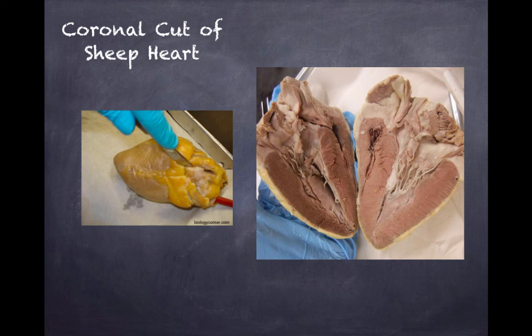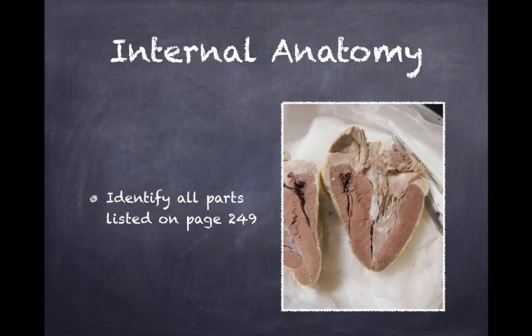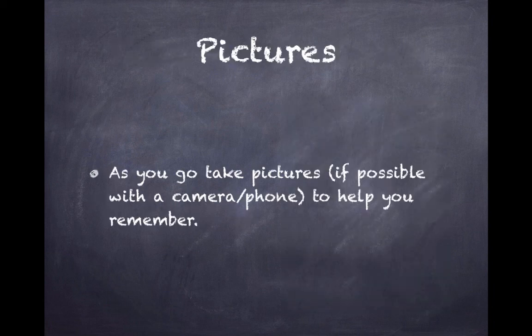Review these structures as many times as needed, answer the post-lab questions, then discard the heart into the regular garbage. You can clean your tray, hands, and tools with soap and water and save them for later. As you go, you might want to take pictures if possible with a camera or phone to help you remember and study.